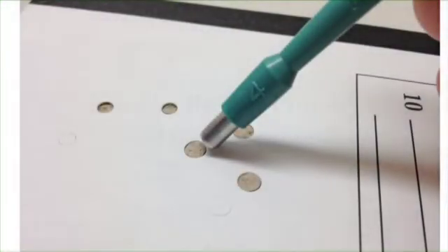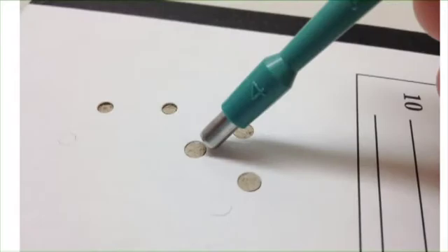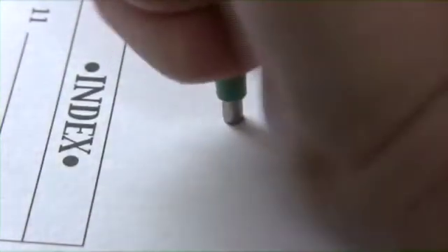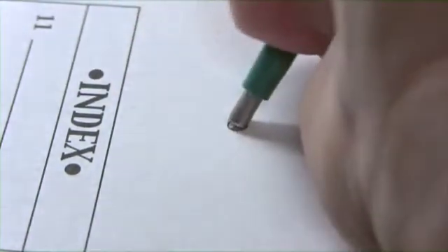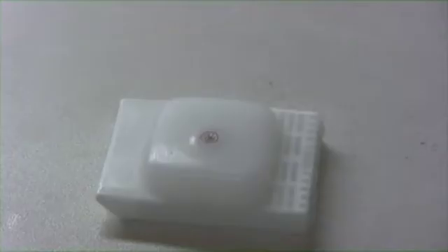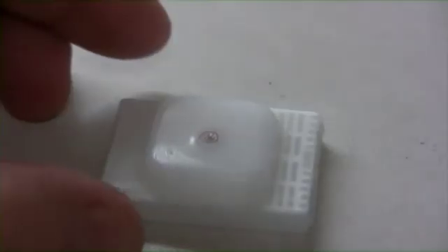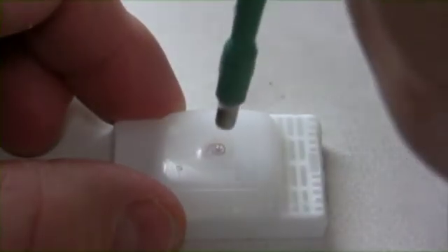When punching an array mold TMA with a 3, 3.5, or 4 millimeter needle, the stylet can leave a dent in the tissue core as it is being extracted. So to protect the tissue, you will need to create a barrier between the tissue core and the stylet. The cardboard from a slide carrier will make an excellent barrier between the tissue and the stylet. You can recycle the cardboard punch — just put it back in the needle and use it as a barrier.